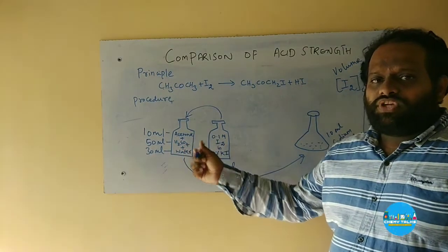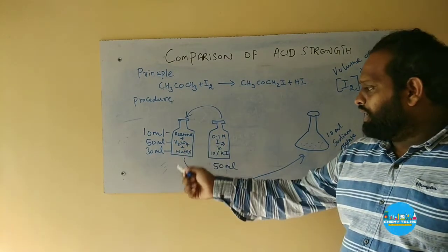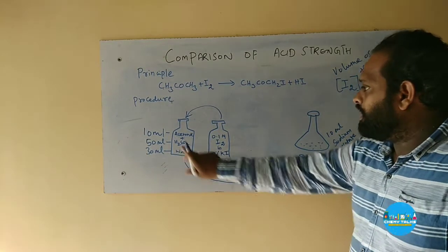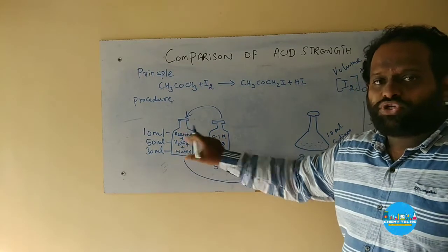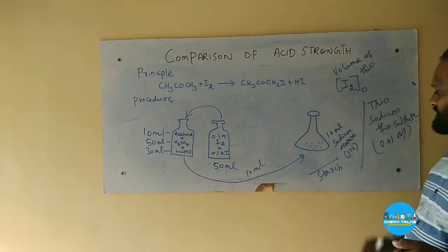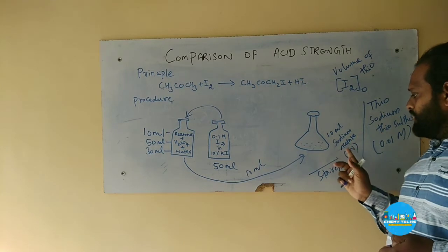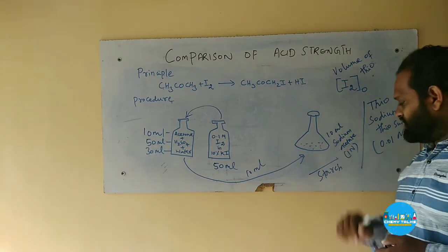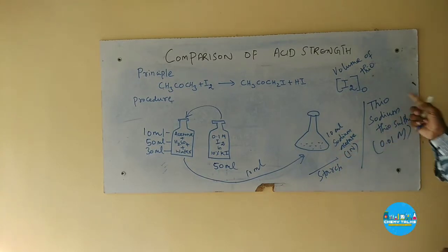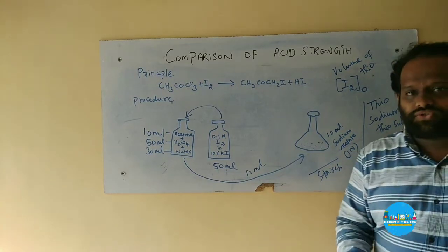After a 3 minute time interval, again 10 ml of this iodine mixture is taken in a conical flask. 10 ml of sodium acetate is added to arrest the reaction, followed by starch, and it is titrated against thio. The end point is noted.